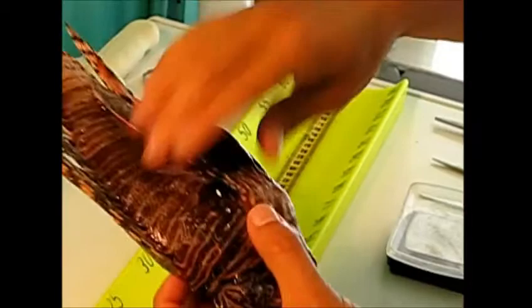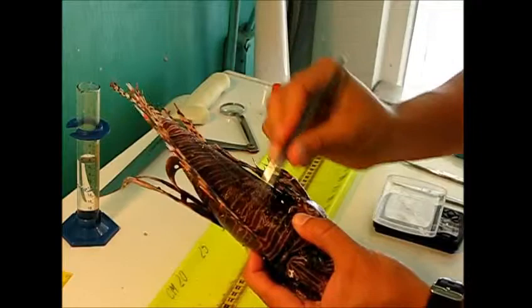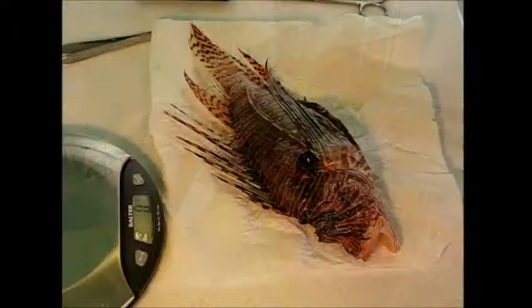Those are the spines you have to watch out for. The pectoral fins on the side are not venomous. The caudal fin is not venomous, and the soft dorsal fin is not venomous as well. The areas you have to watch out for are the dorsal side, and then those two pelvic spines, and then the three anal spines.